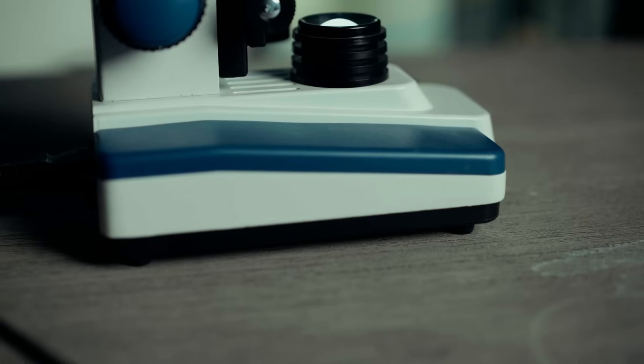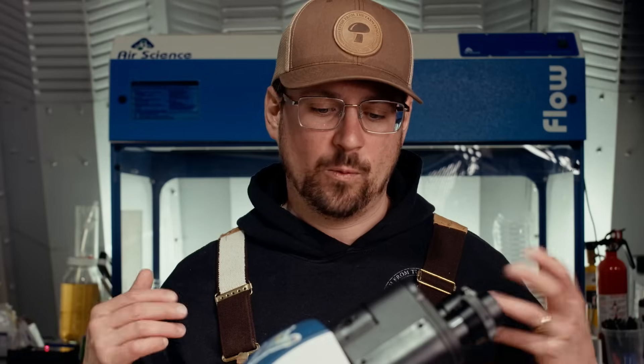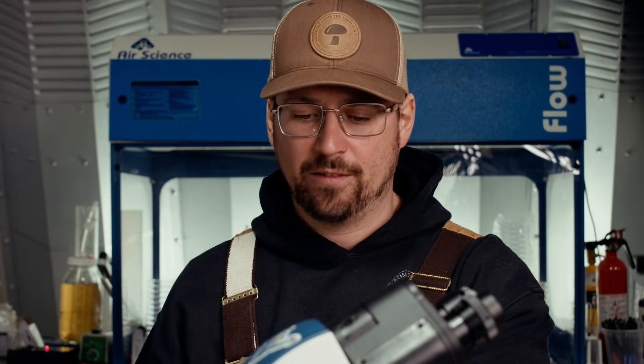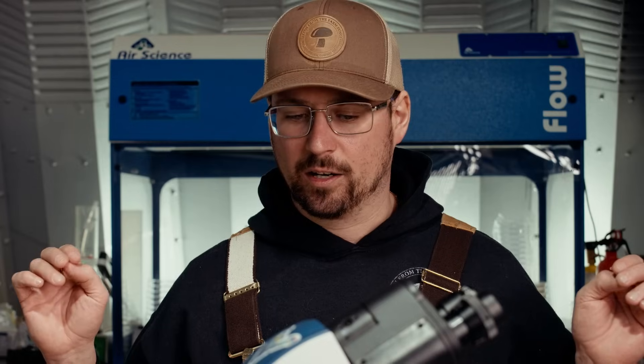To break down the microscope, I'll start at the structure from the base and work my way up to the lenses. The bottom is called the base — this is where all the parts of the microscope are attached. When you're looking into a microscope, you want a nice firm base. Oftentimes people will extend the base to the actual structure the microscope's on, so you want a nice heavy desk or table. It's best to work on a granite countertop if you're going to be using very high power microscopes, because little vibrations can amplify when you're looking down the lens.